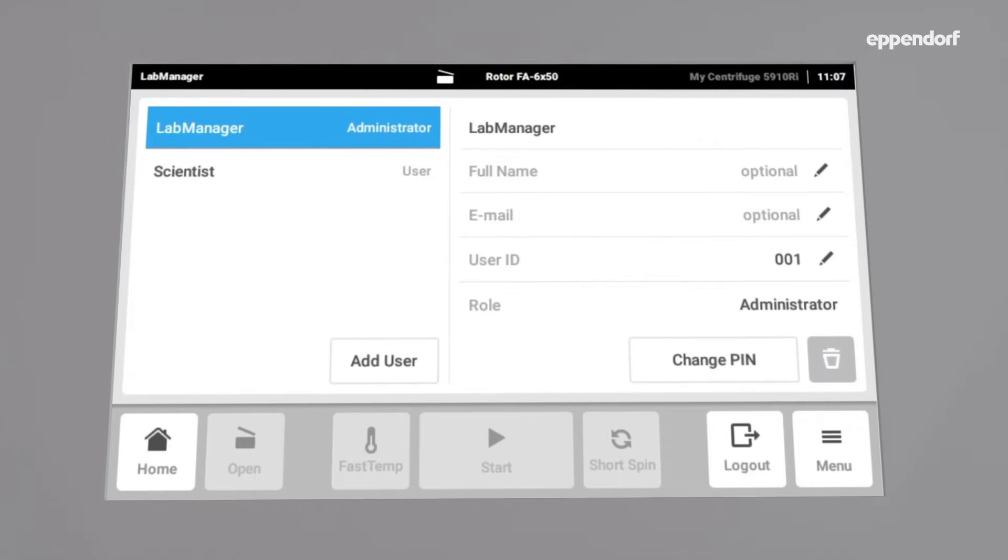Firstly, we have the Administrator, a role with unlimited access to all functions of the centrifuge software, such as creating new users.